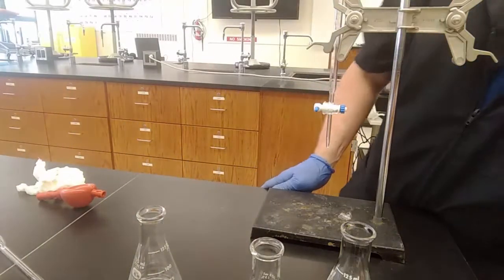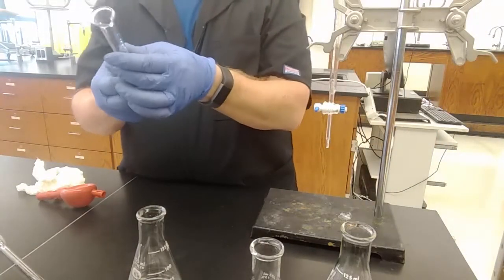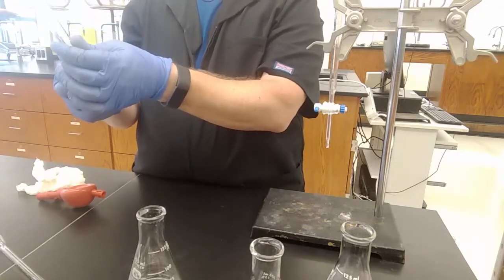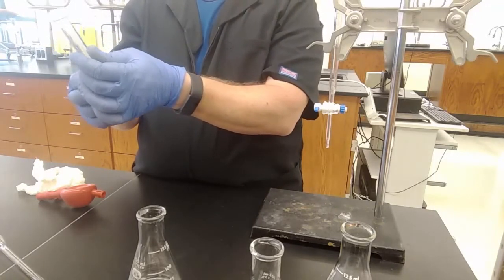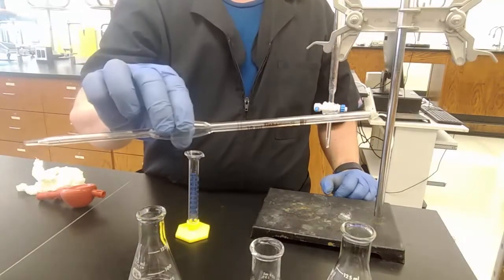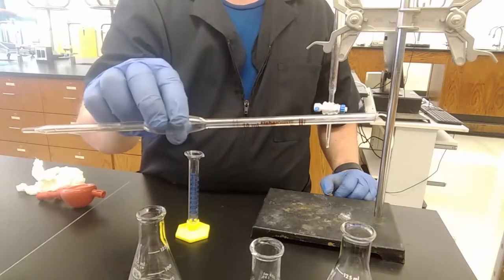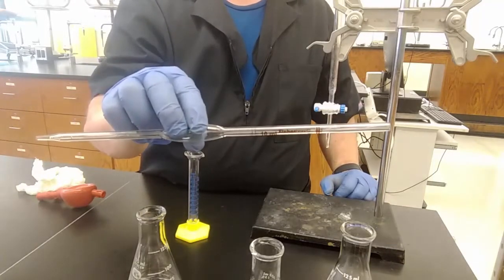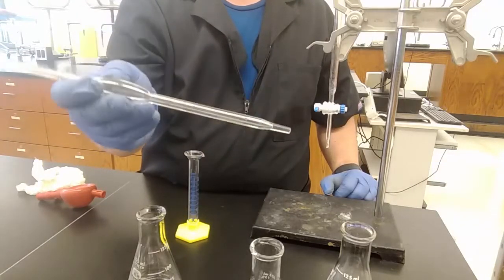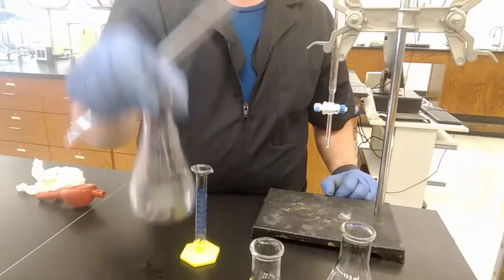Let's take the 10 milliliter graduated cylinder and remind ourselves what it says on it. Plus or minus, doesn't say. I'm pretty sure this is plus or minus 0.2 milliliters. Plus or minus 0.02 milliliters for the pipette: an order of magnitude, one decimal place, more precise. Now, yeah, this one is old, and so it had droplets adhering to the inside, which is not good, but it's still more precise than this, which is infinitely more precise than this.